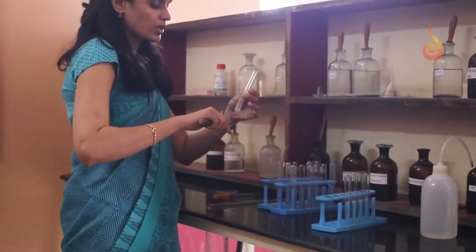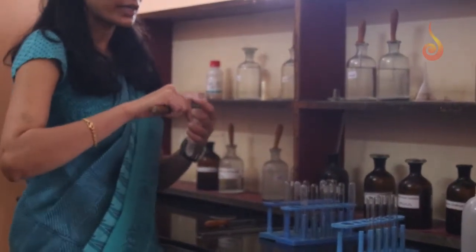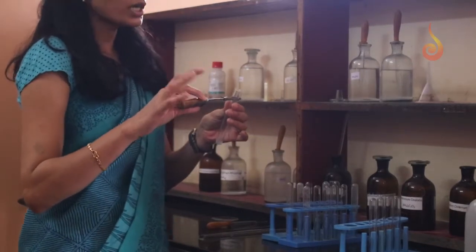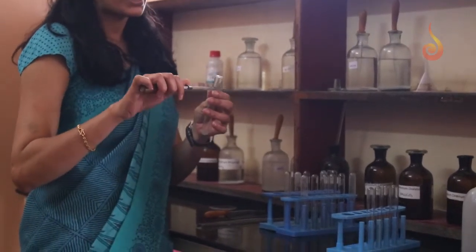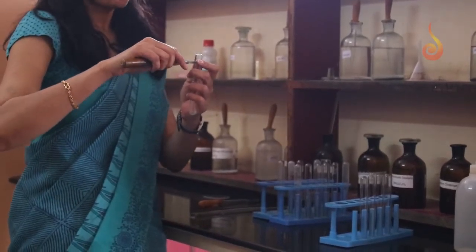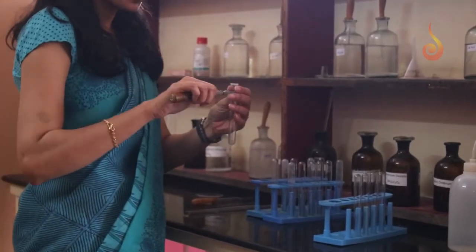Why will we be using a test tube holder? Whenever we are heating or boiling the reaction mixture, we always use a test tube holder. So we place the test tube in the test tube holder and then close the knob. This is how the test tube holder is used.